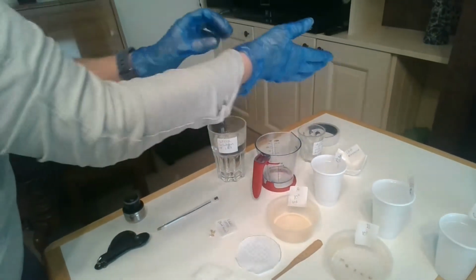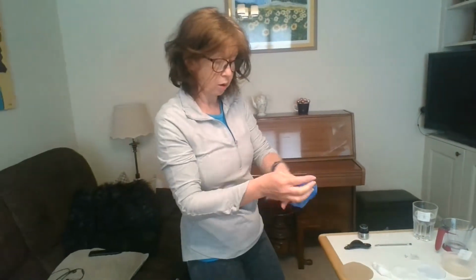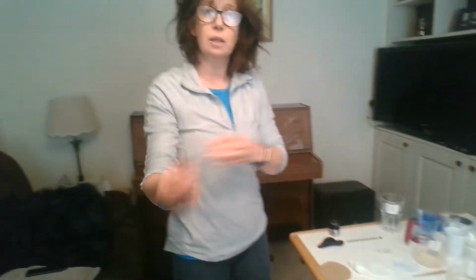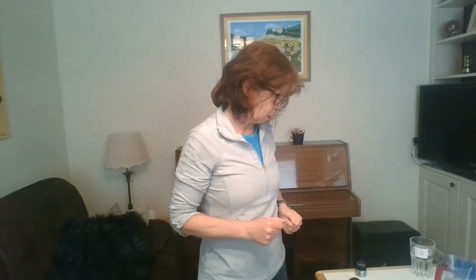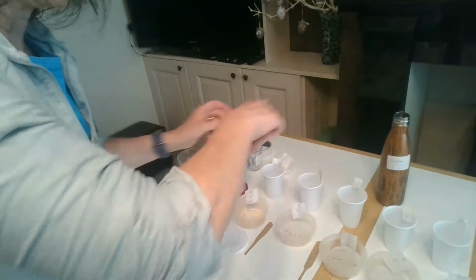Now that I've done anything that's kind of concentrated, I can get rid of the gloves. I don't need those anymore. And students wouldn't need gloves because the IAA solution that you are using is so diluted it wouldn't harm you at all.